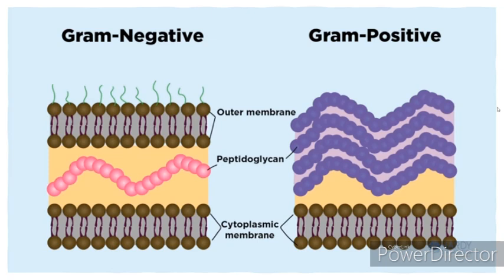There is no coincidental reaction unless you over decolorize, which would be the only case something would be falsely gram negative or falsely gram-positive, that decolorizer step. So gram-positive bacteria have significantly larger peptidoglycan layers on their cell wall, essentially.